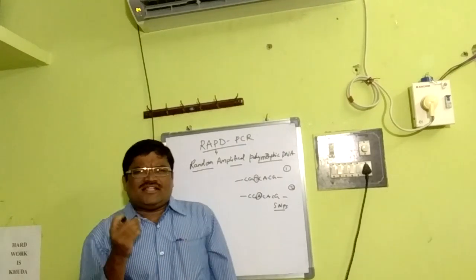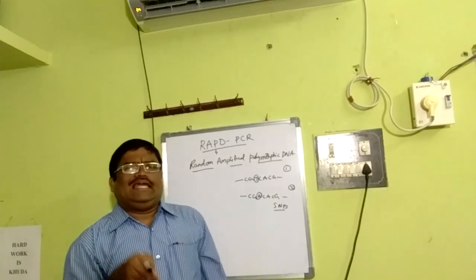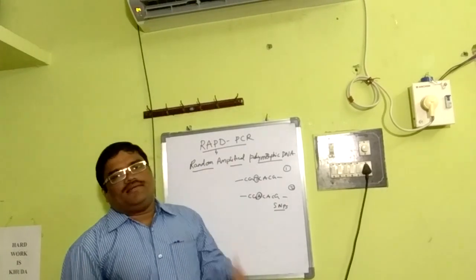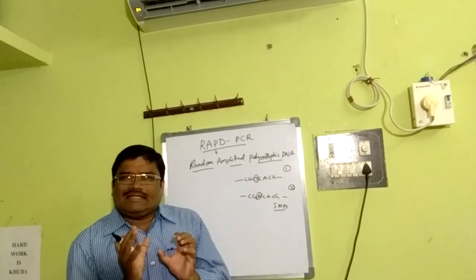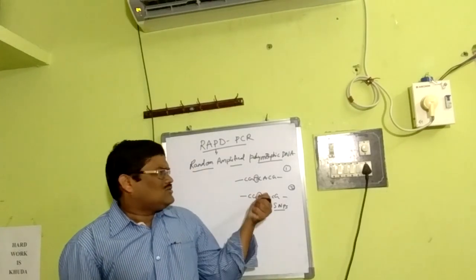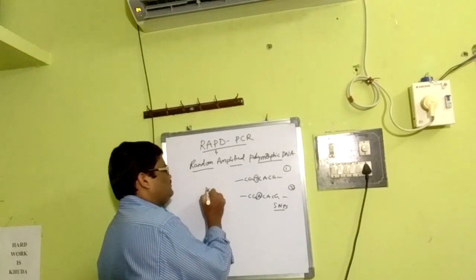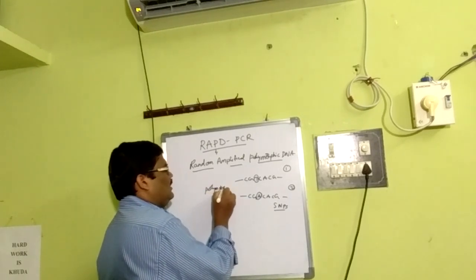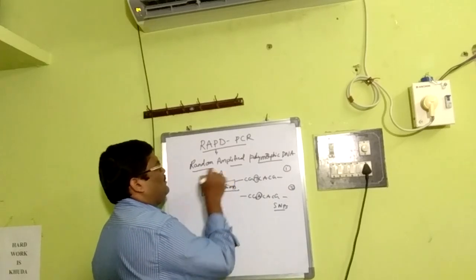To identify the genetic variations based on polymorphic DNA, we have to employ RAPD. That is the reason why we have to apply RAPD, because we have to find this out. So polymorphism is the basis for variety, and RAPD detects it.